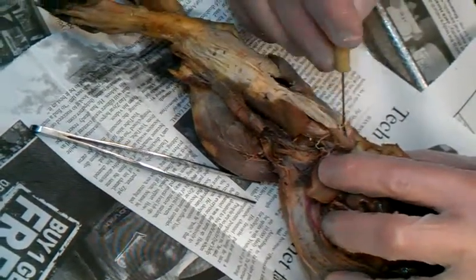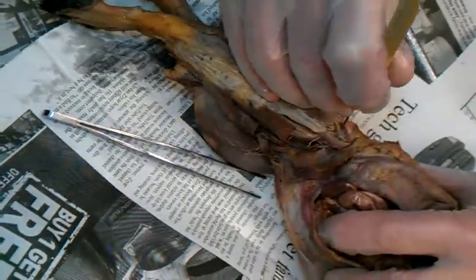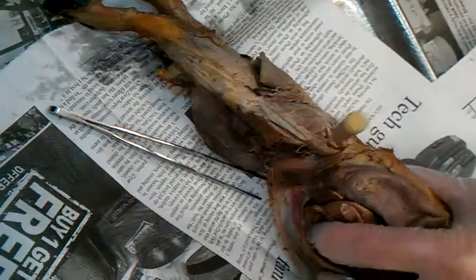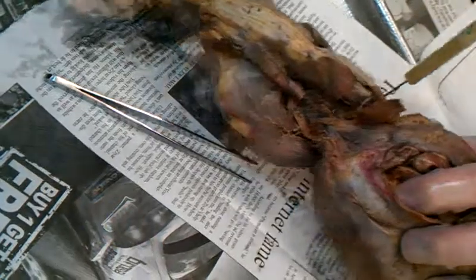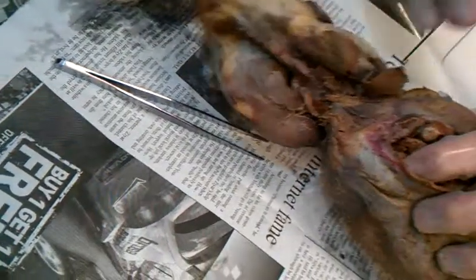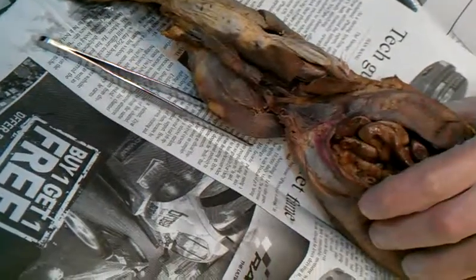All you have to do is separate them so you can see them, so that when your teacher gives you a test on the lab day and she sticks a probe in there like that, you can identify what it is from the other two. Or she may say the name and you'll have to find it and poke it. So if you can't find it on your own mink, you're in trouble.